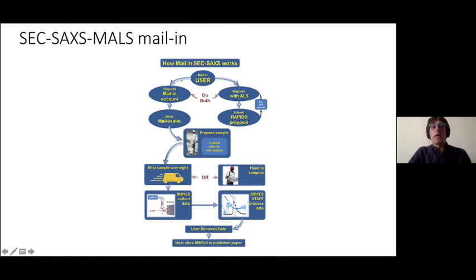In general, we have a mail-in set. Now we're also using the mail-in for size exclusion coupled SAXS. And you get all this information on our homepage, where you can allocate your time. I will show you in detail a little bit how to do it.